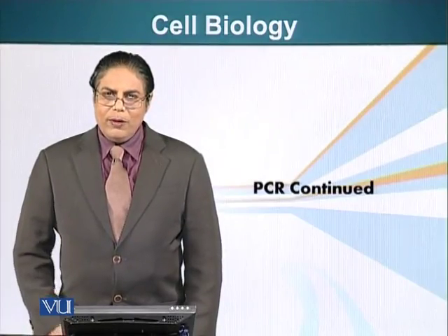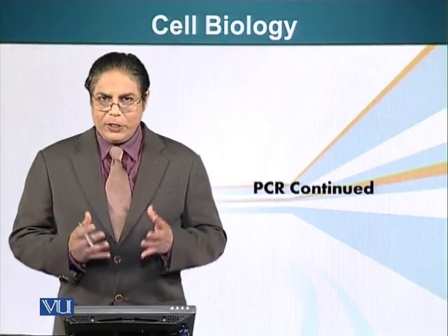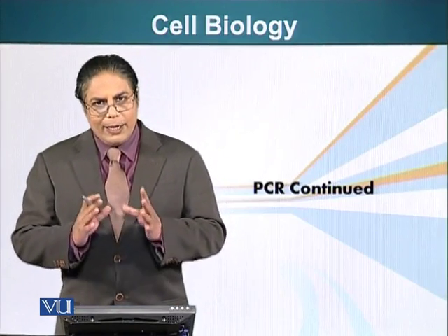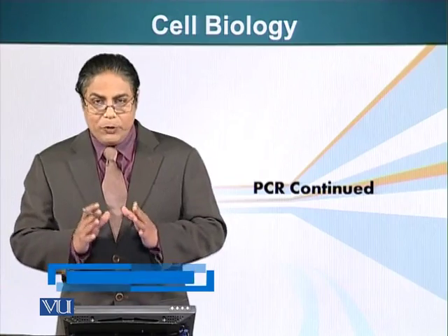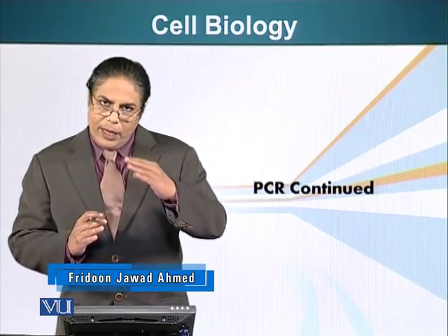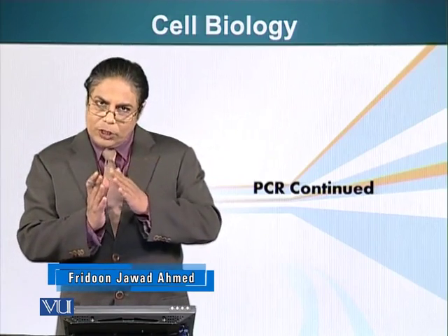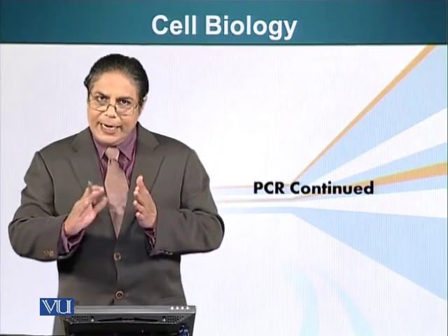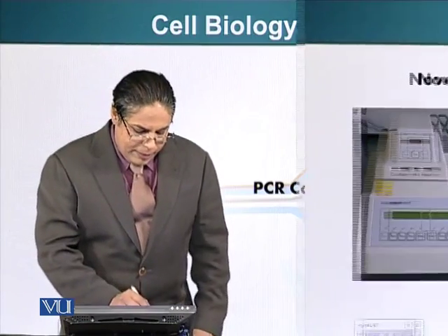In this module, we look at the equipment used for PCR reactions, and we will also see how long it takes for one step to complete, which is 3 steps we talked about: raising the temperature to separate the DNA strands, annealing the primers, and extending the primers. So let's look at that.